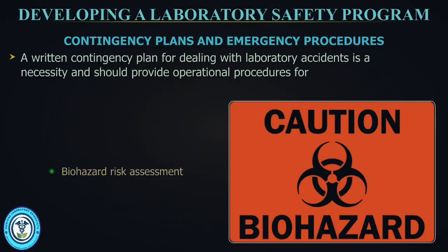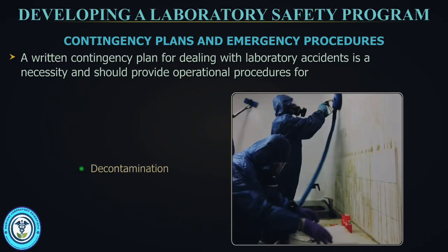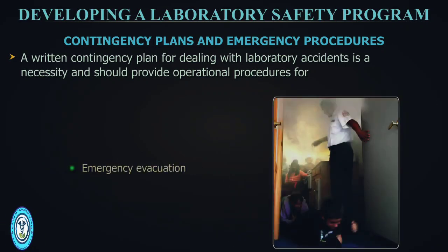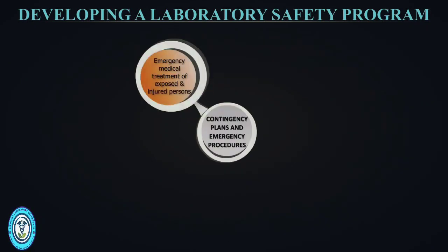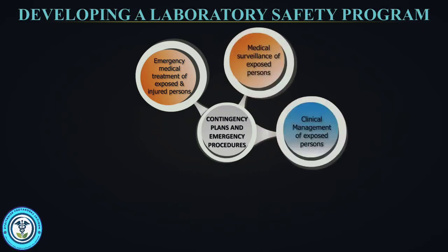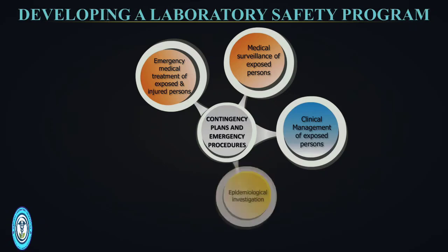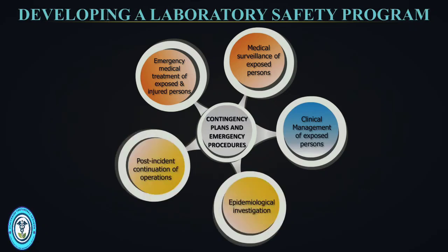Biohazard risk assessment, incident exposure management, for example, needle stick injury, and decontamination. Emergency evacuation, team protocols for evacuation, emergency medical treatment of exposed and injured persons, medical surveillance of exposed persons, clinical management of exposed persons, epidemiological investigation, post-incident continuation of operations.